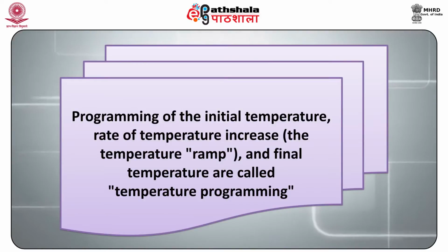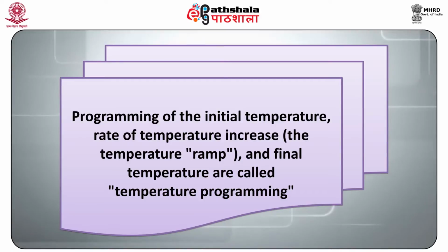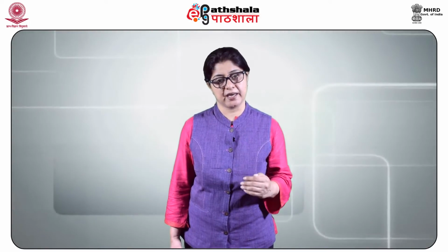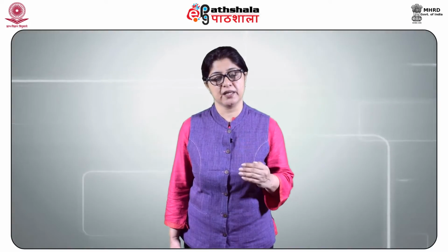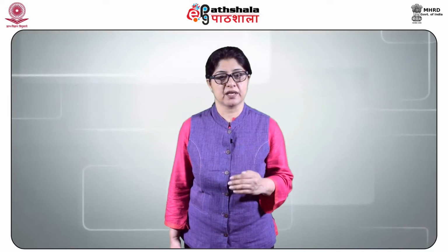Programming of the initial temperature, rate of temperature increase, the temperature ramp, and the final temperature is called temperature programming. Temperature programming allows the analytes that elute early in the analysis to separate adequately, while shortening the time it takes for the late eluting analytes to pass through the column.